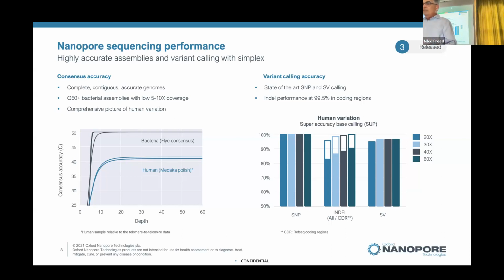Indels have always been challenging, and they are for all technologies for that matter. I learned that fairly recently. I thought Illumina was the gold standard. Nope, they have problems as well. And in fact, when you look at indels in protein coding regions, we're pretty good. We're well over 95% F1 precision and recall at pretty modest coverage, 30, 40-fold coverage. When you move to the whole genome, that does drop. It's around 80 to 90% F1. Clive's talk last week revealed he's got some strategies in mind that are going to increase that accuracy across the genome, so looking forward to seeing how they roll out.